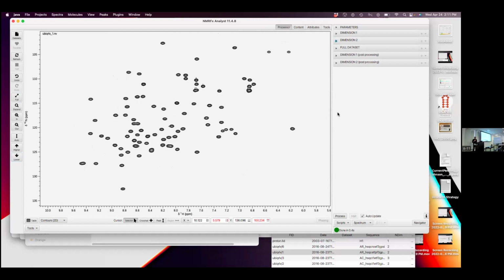Questions, where do I want to go next? I can do some more with this experiment, or we can go off to a 3D experiment. I have a question. Yes. Is it possible to look at the T1 program? Yeah, T1?